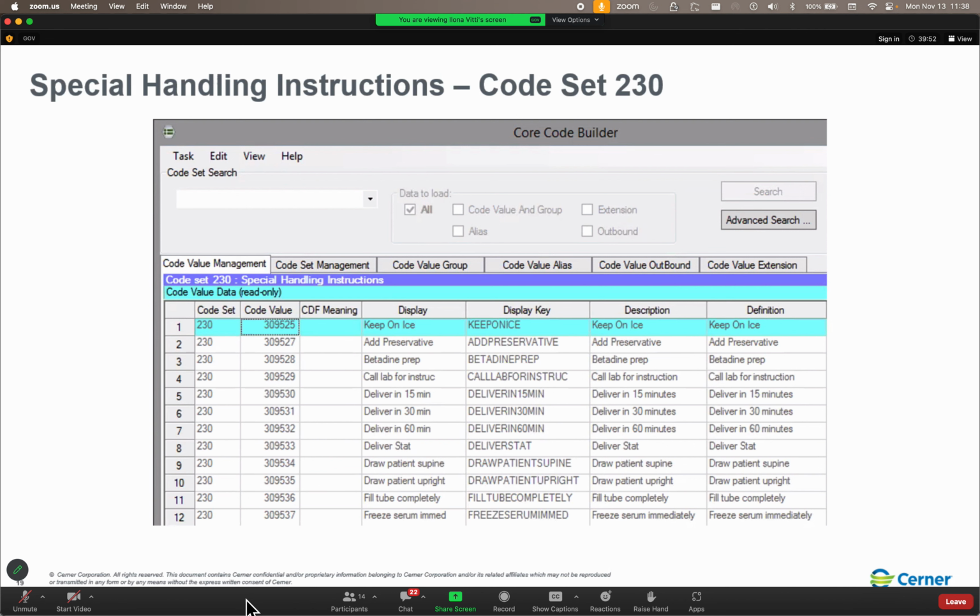And by having Micro and Blood Bank and Helix and GenLab all use the Julian dated accession numbers, that means we've got fewer calls on the alpha prefixed accession number, because it does refresh every year.